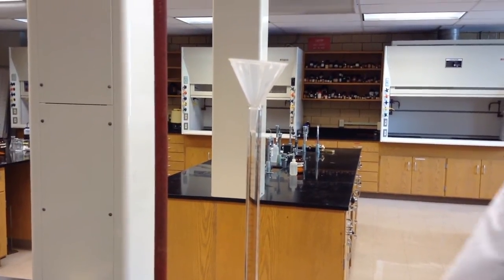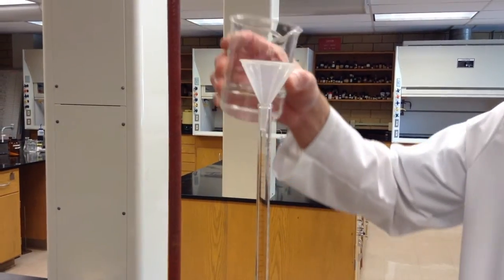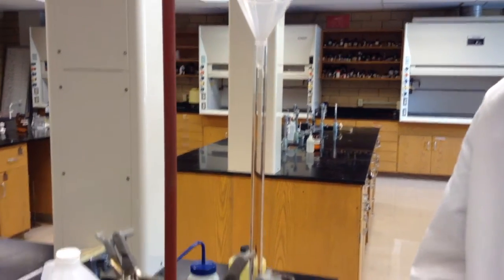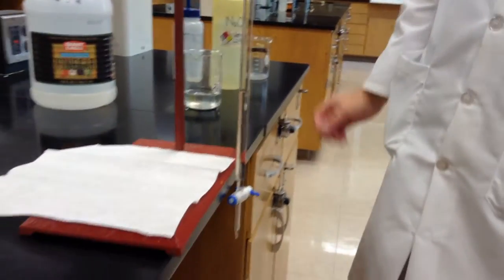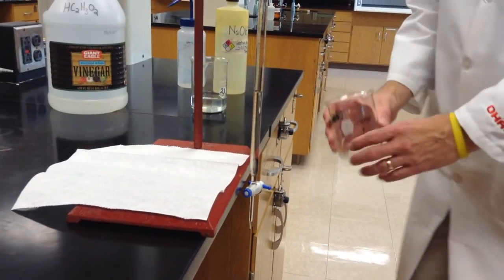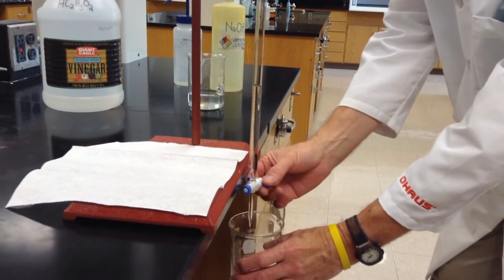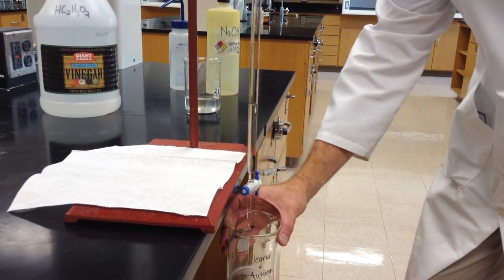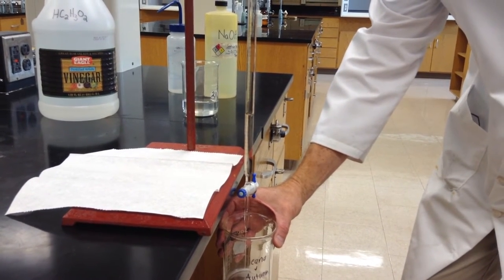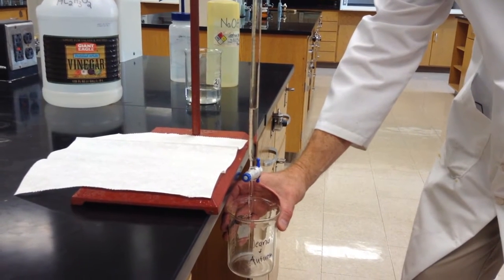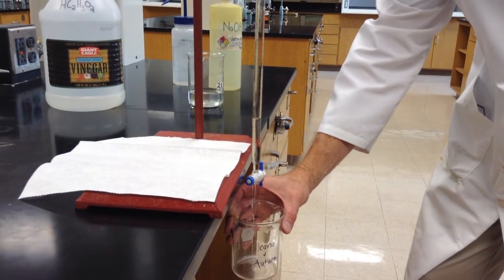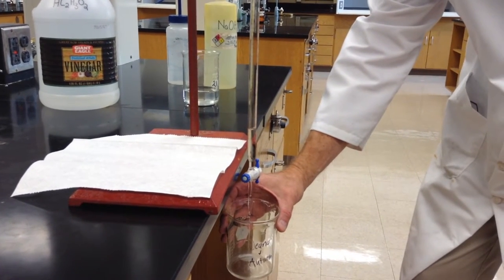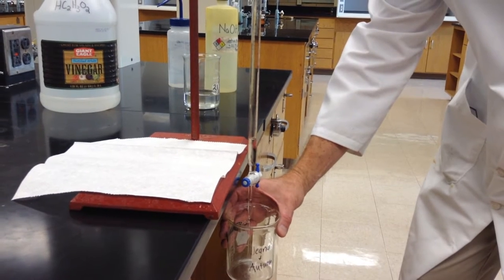We then want to wash the burette with two 5-milliliter portions of NaOH. From a beaker, add approximately 5 milliliters of NaOH through the funnel. Then, with a waste beaker, open up the stopcock and drain the 5 milliliters through the bottom. This will help to wash the burette of any contaminants. Once you have drained all 5 milliliters of the first wash, close the stopcock and then add a second fresh 5 milliliter wash to the burette and drain it out as well.